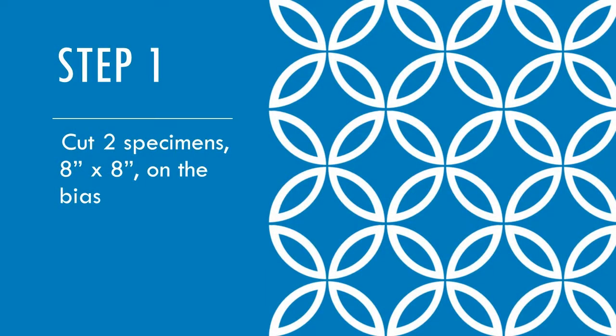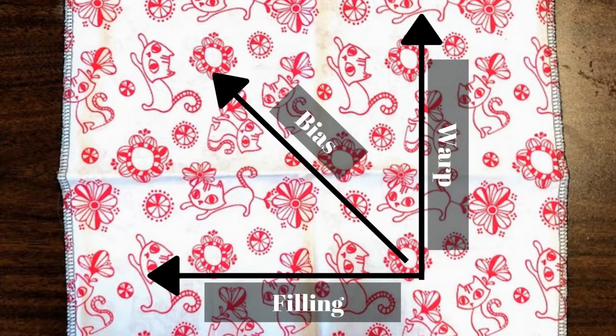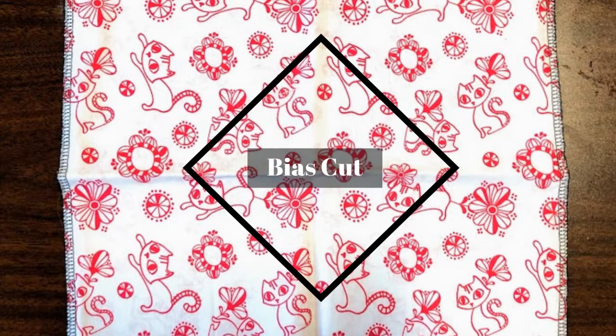Step 1. Cut out two specimens each 8 by 8, cut on the bias. Bias is where you cut diagonally across the grain at a 45 degree angle.